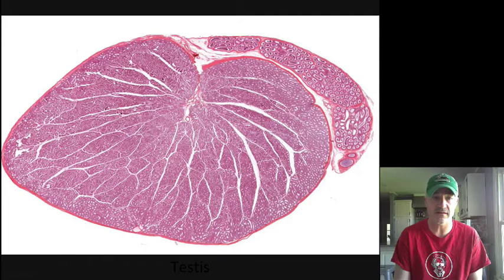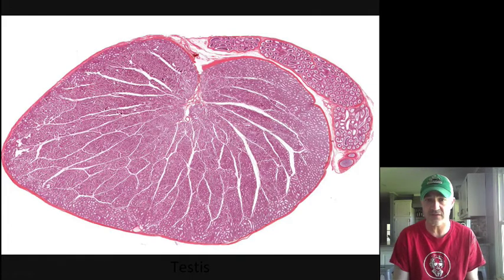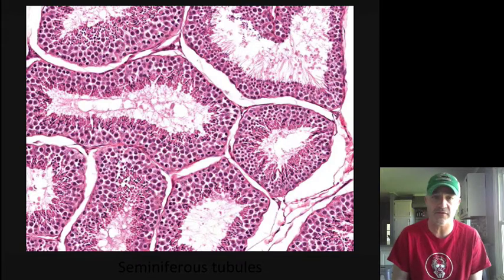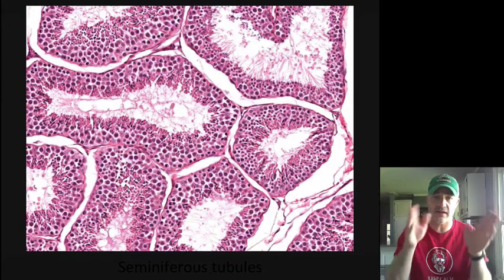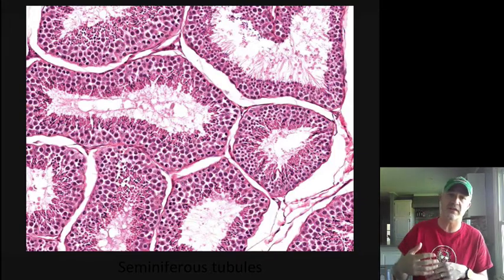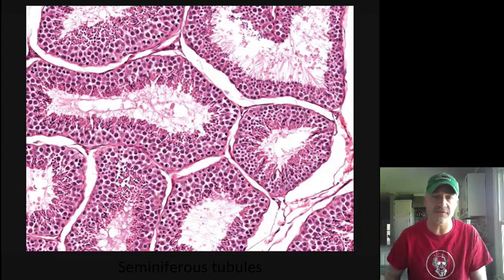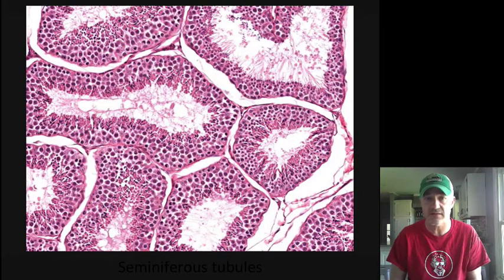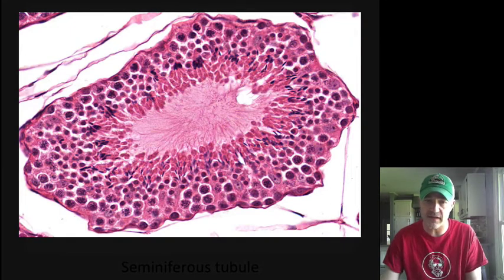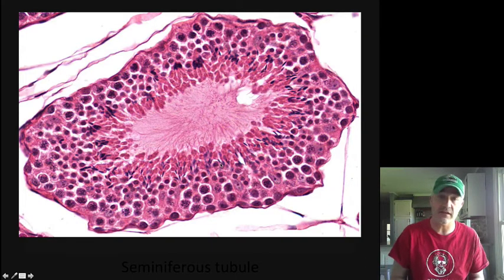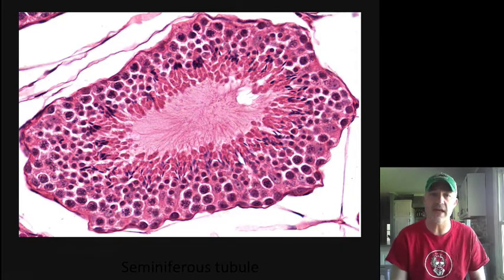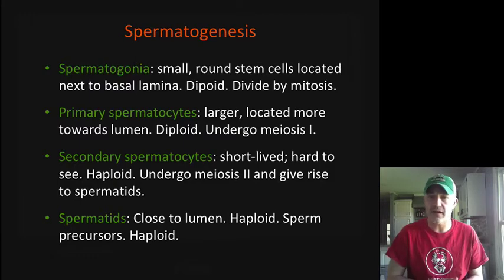This shows you the testes right here — you can see lots of circular tubes even on the zoomed-out image. As we go in a bit more, these are what we refer to as seminiferous tubules. If you look at the outside of those tubules, those are the beginning sperm stem cells. As they work their way from the outside toward the lumen, they are in different stages of differentiation, getting to those haploid sex cells. You can see the shape of the nucleus change — the nucleus gets smaller as we approach an actual spermatozoa.